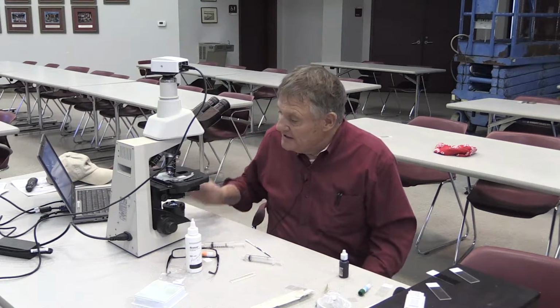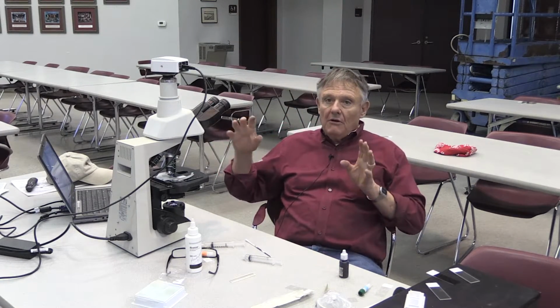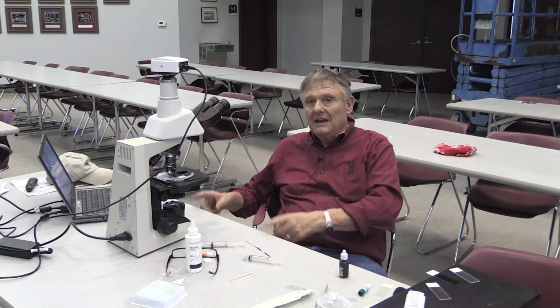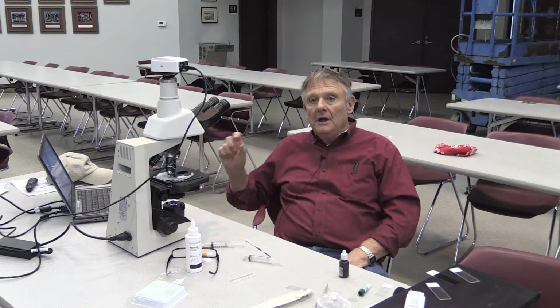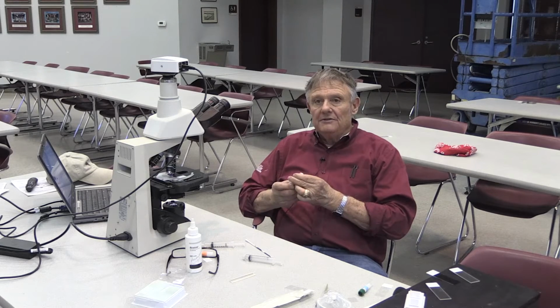Now, this scope is equipped with a phase contrast. Some veterinarians will skip the staining part and just look at each individual sperm on phase. I kind of like the stain because I can tell things a little bit better looking at stain. But if your veterinarian is not staining and he's looking at morphology, he's most likely using a phase contrast scope. That's each individual's preference, but my preference still is to stain the organism.